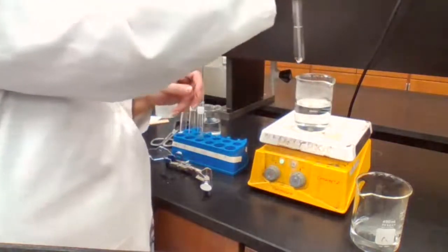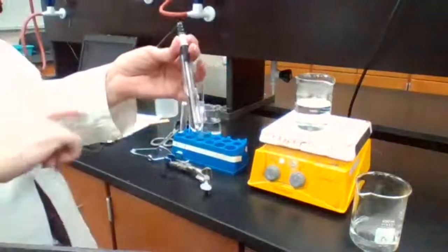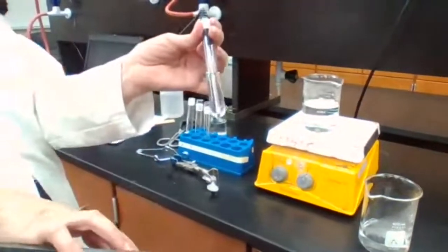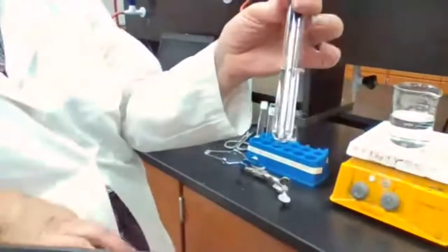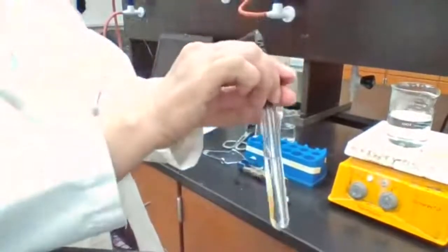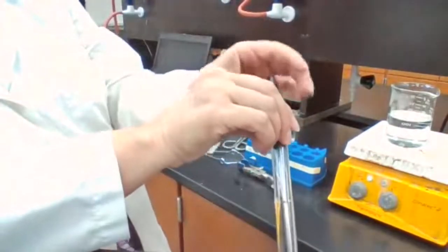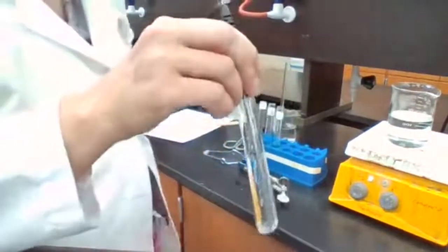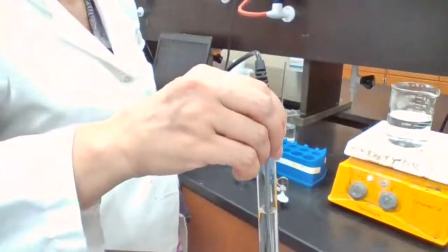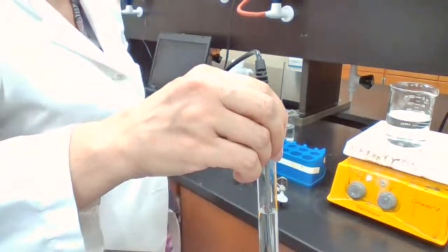Okay. While it's in the solution, now we have 93 degrees. The temperature is dropping. And as soon as I see the crystals, I will give you the temperature. I don't have any crystals yet, but you're right. This one is going to be the highest of all four. The temperature at which you get the crystals is going to be the highest of all four.